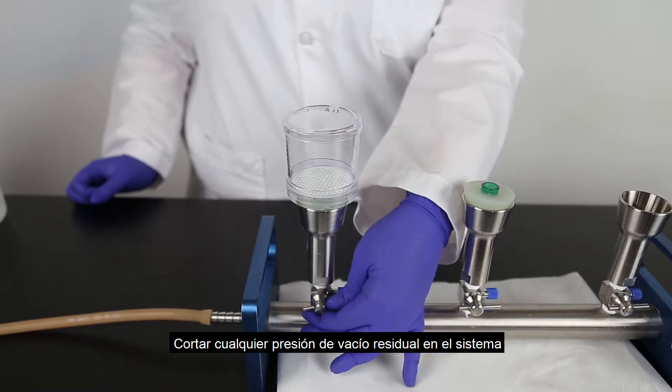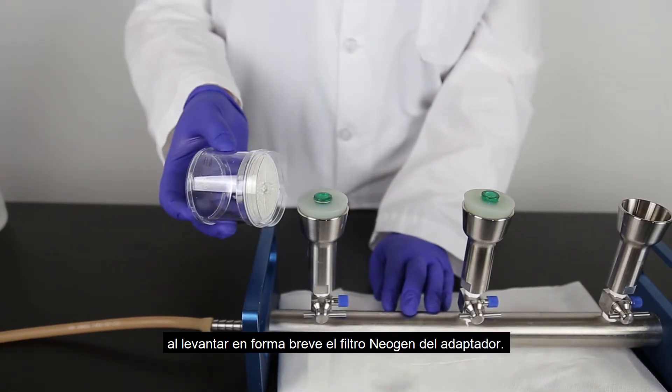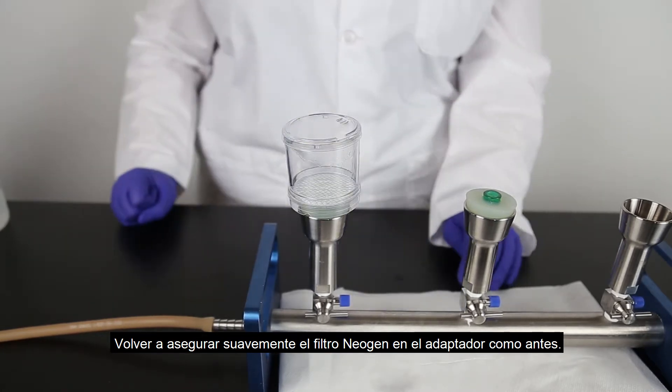Break any residual vacuum pressure in the system by briefly lifting the Neogen filter from the adapter. You do not need to remove the adapter from the stopper, just from the monitor. Gently re-secure the Neogen filter into the adapter as before.